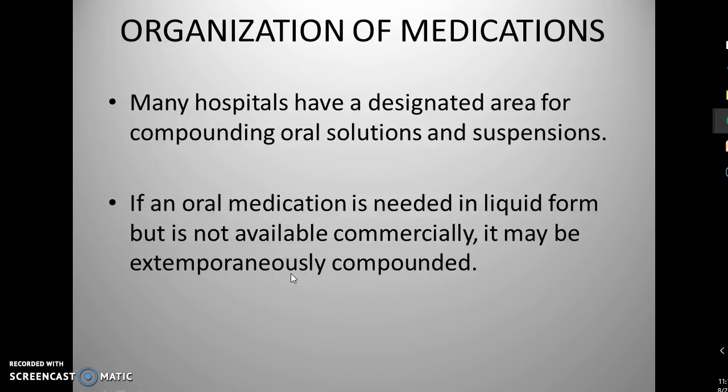Okay, in this particular section of chapter 16, we are talking about extemporaneous compounding. It must be noted the following. When required to prepare an extemporaneous compound, the pharmacy technician will follow a recipe for the compound.